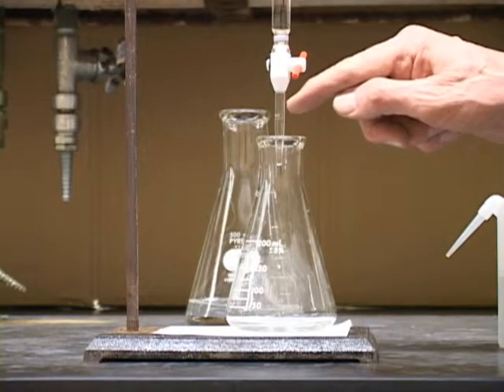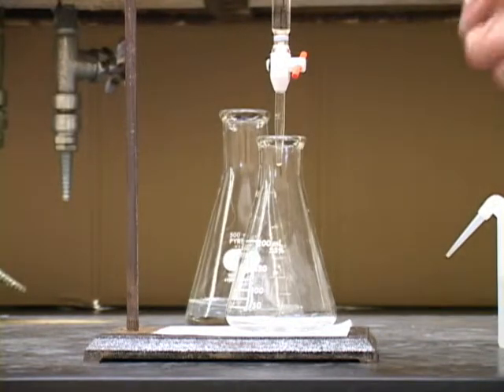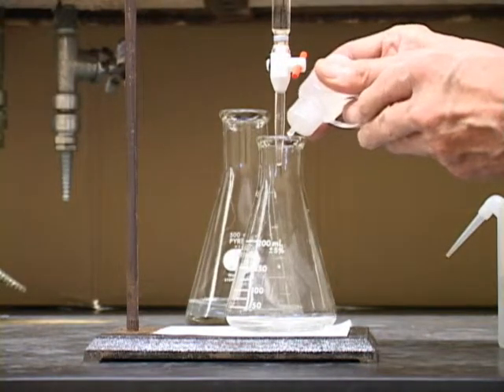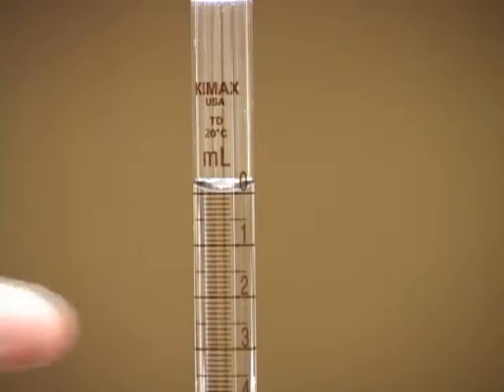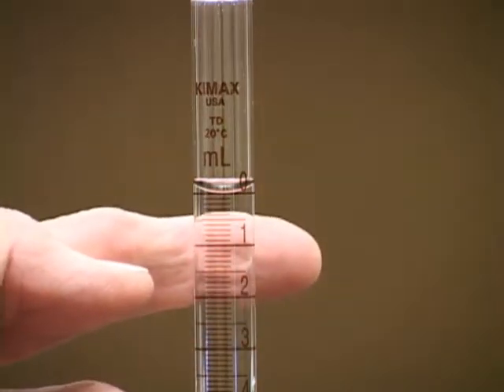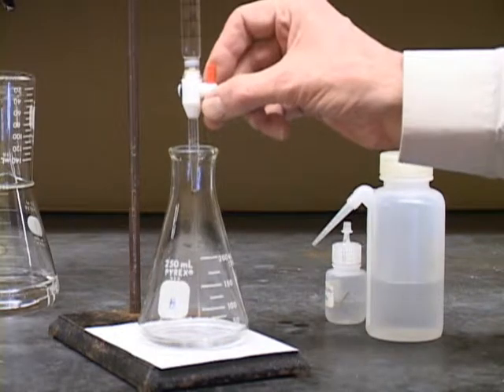As you can see, the tip is filled. There is no bubble there. There's no drip hanging from the tip. We'll put a couple of drops of indicator, phenolphthalein, in, and now we'll read the initial volume. The initial reading is 0.00. We can now start adding the sodium hydroxide.